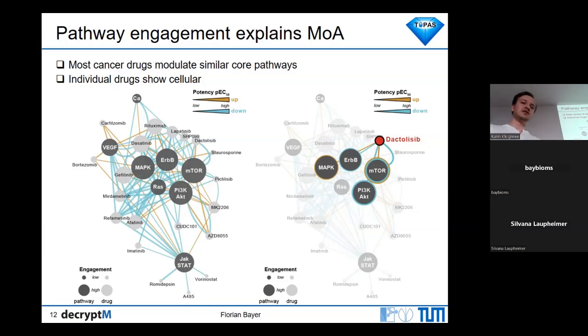And what I found very interesting is that you treat with dactolisib, but then the cell at higher concentration has this counteracting effect. What you see here is upregulated MAP kinase signaling, while mTOR most of the time is downregulated, but there are also some components of mTOR which are upregulated. So if you think most of the cancer drugs are well understood, they're really not understood. It's all over the place. Meanwhile, for instance, AKT is going down, and quite potently. So that's what it's supposed to be, but there's way more to explore.